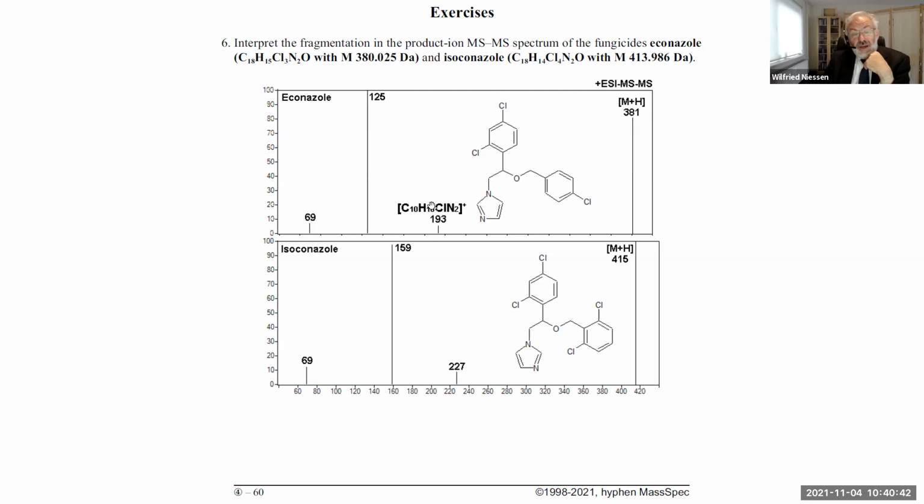And then we have the 193. If I understand you correctly, you basically would like to combine the imidazole and the benzyl. Which would mean, in terms of the way we discussed in our previous session, a skeletal rearrangement, where you see the rearrangement of the benzyl group from the oxygen, most likely to one of the nitrogens of the imidazole. And what you kick out is all that.